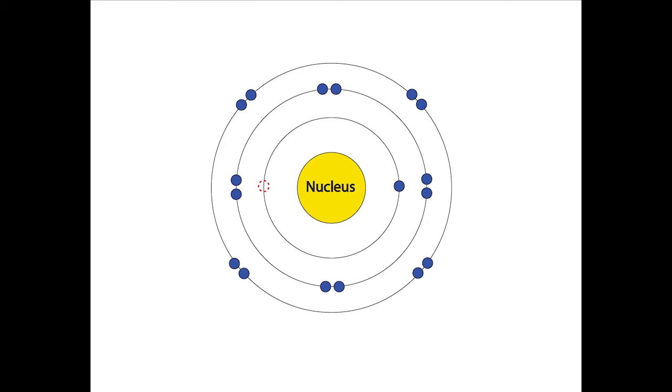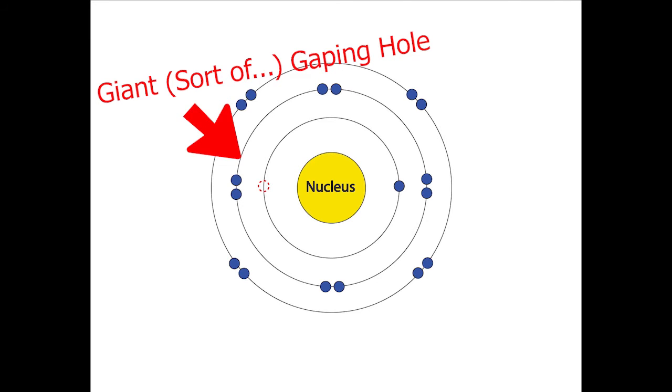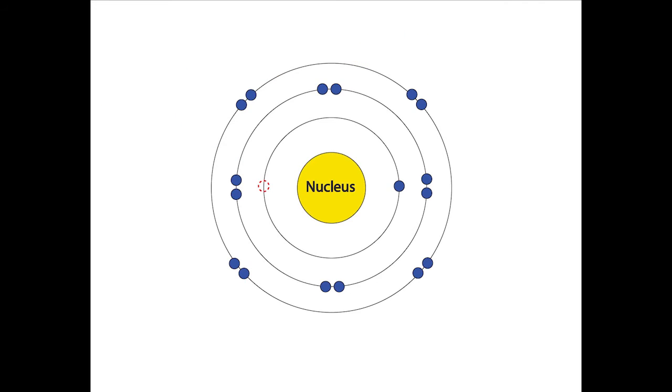Once the SEM produces its image from all of the secondary electrons that we just blew out of the sky, what is left behind are a bunch of giant gaping holes in the electron clouds of the atoms in the sample. If these holes are from the inner rings, that makes the atom very unstable. So it needs to fill that hole with another electron.